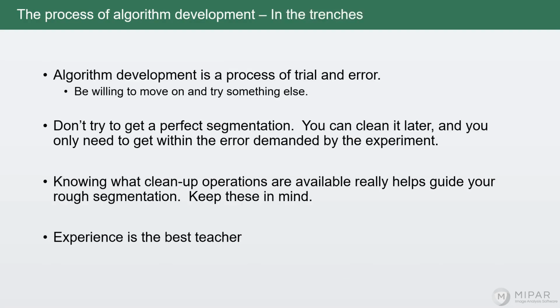So a couple of lessons that I've learned through the process of doing lots and lots of image analysis algorithms is that development is going to be trial and error. You're going to have to use different ways of segmenting, different ways of cleaning, different pre-processing filters to highlight the different things you might want to identify.